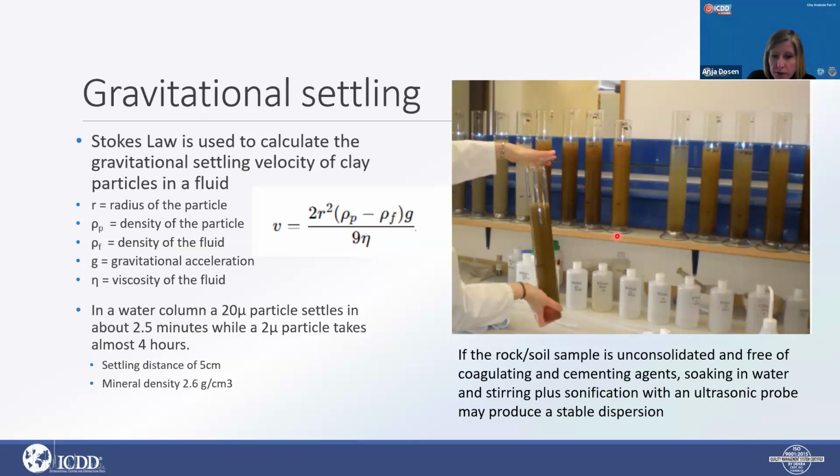One thing that I want to stress is that what settles down are heavier minerals, more crystalline phases generally, and things that we're not necessarily interested in. We want to look for the clay fraction, the less than 2 micron fraction, that is generally contained in the top part of the settling tube.